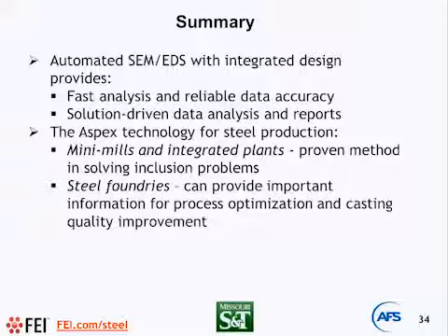By applying automated inclusion analysis, we collect the whole spectrum of inclusions, and I have a couple of articles presented at the American Foundry Society. More interesting is another application.